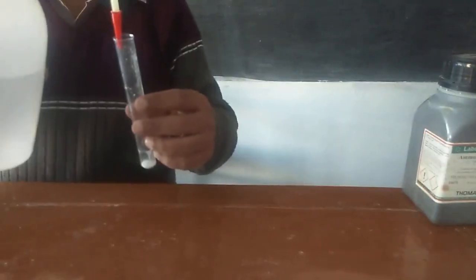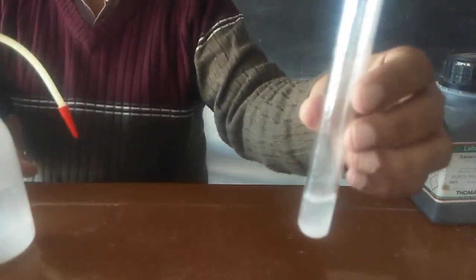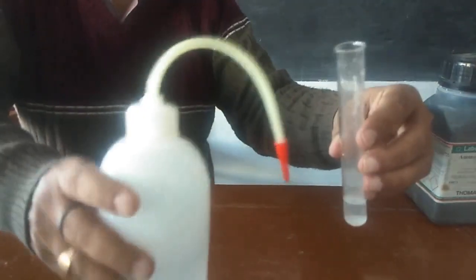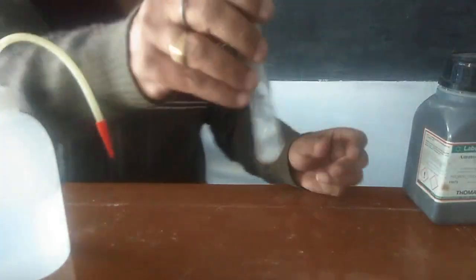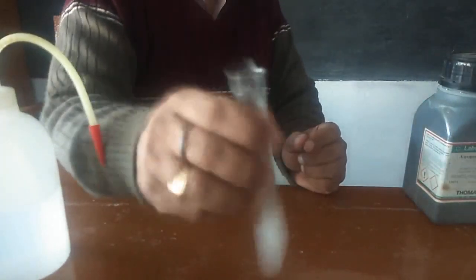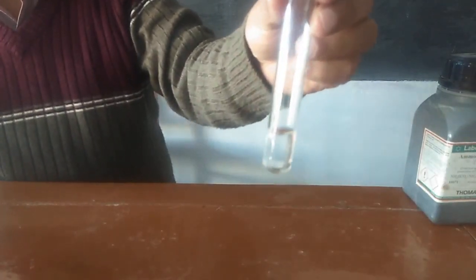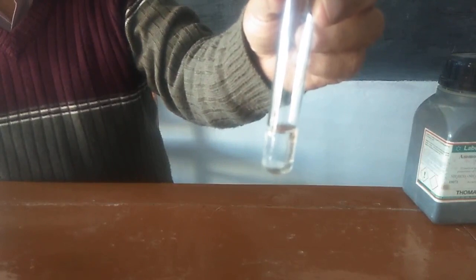We will take some salt in a test tube and add distilled water. We will shake the test tube and check the solubility. The salt is completely dissolved in water. This shows that ammonium carbonate is soluble in water.